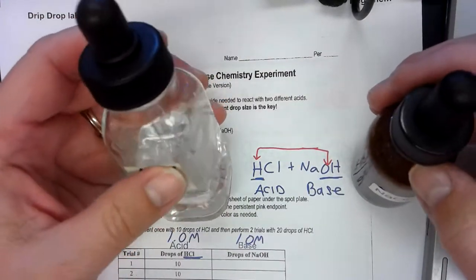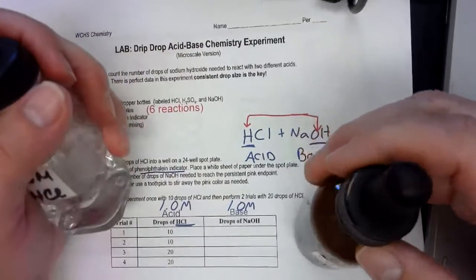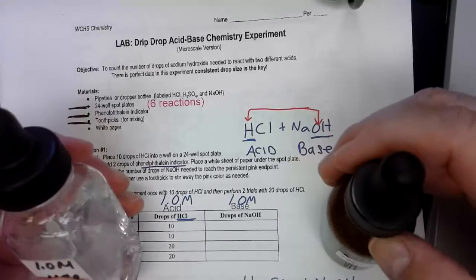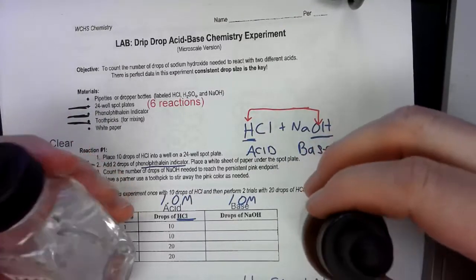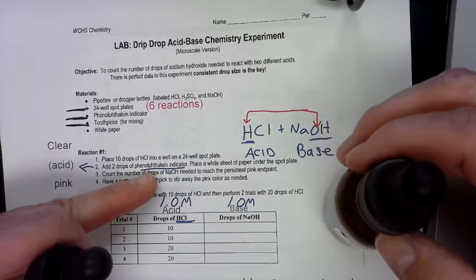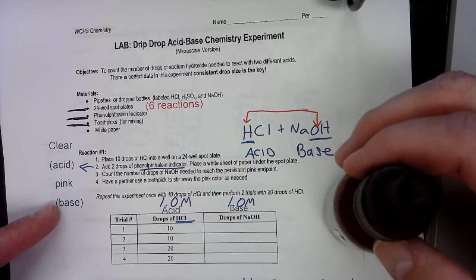And so you can write them right here. We're going to use a 1 mole per liter of each, and we're going to add in 10 drops of acid. Then we're going to add in 1 drop at a time with the base, and we're going to use a color indicator called phenolphthalein, and it's clear when it's an acid and it's pink when it's a base.